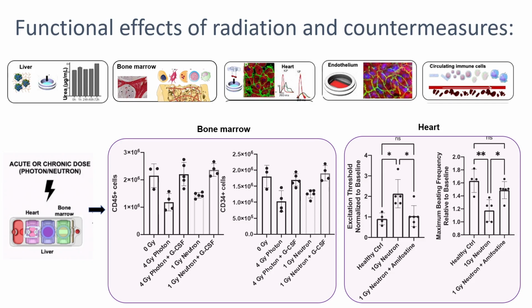And then you have exposure to radiation, but of the bone marrow tissue, that was supplemented by GCSF, which is a radiation protection agent. And you see that actually much of the effect is avoided. And then another type of radiation, also with the GCSF. A very similar situation for CD34 positive cells. For the heart, qualitatively similar.